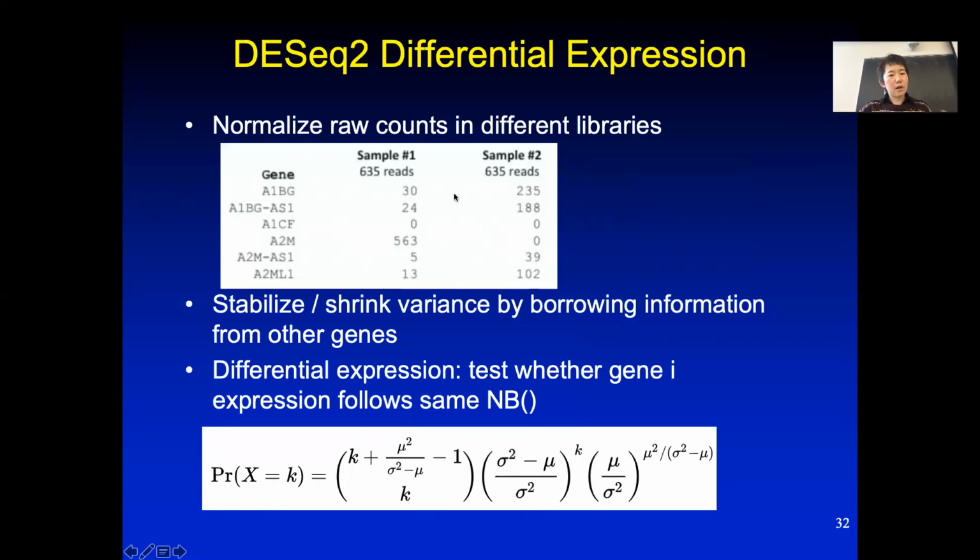And so DESeq has another way of normalization. Basically, if a gene is super highly expressed in one but lowly expressed in the other, those genes are eliminated. Basically, it uses most of the genes that are assumed to have reasonable expression and not too much fluctuation to estimate how many reads those genes have among the samples.